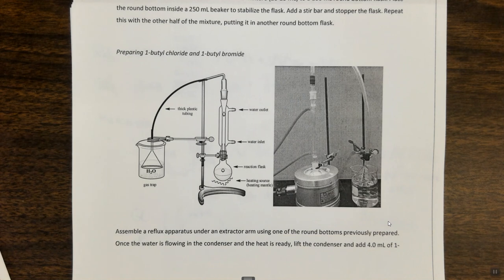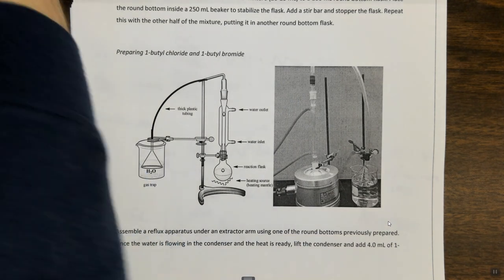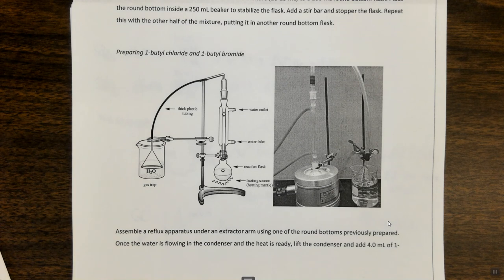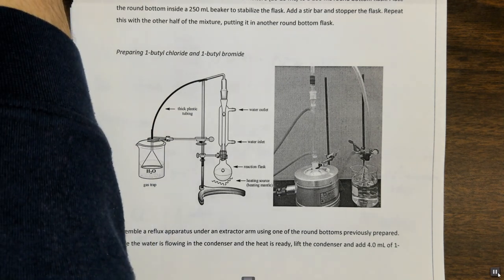You're then going to reflux the mixture for about 45 minutes and then cool it down and work it up. After we talk about the T-butanol, the SN1 reaction, we'll talk about the workup in the form of a separation scheme.